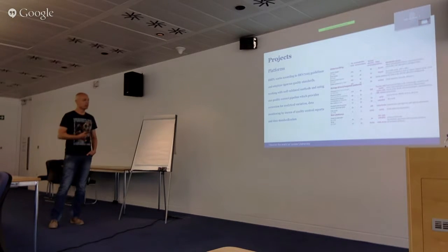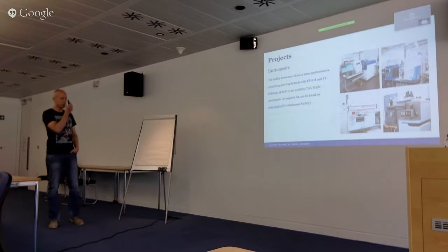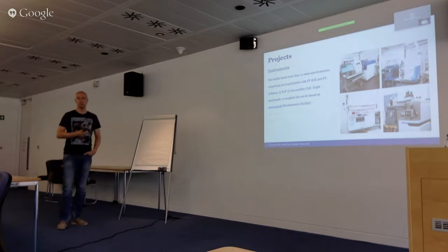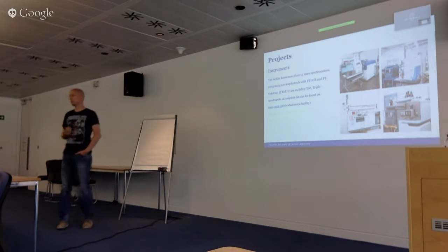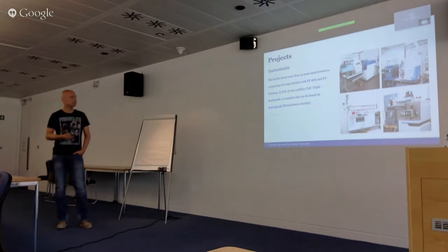We have a large variety of platforms, but also a large variety of machines and vendors that we work with. Also, I think this is one of our biggest challenges when you come to data processing, data storage, and conversion between the formats, and also having comparable output.